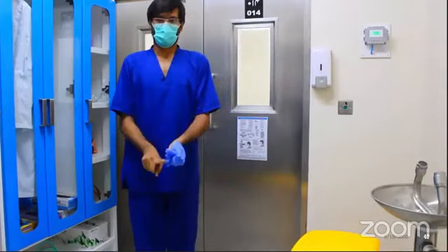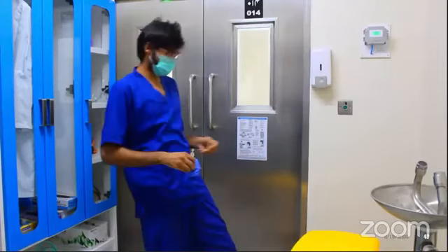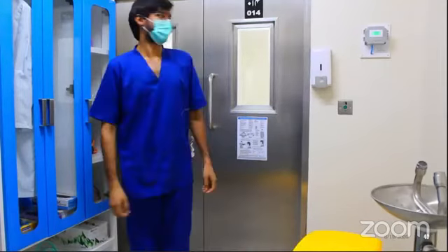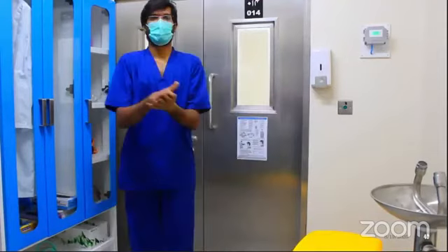Now remove and discard the gloves. Take care not to contaminate the bare hands. Sanitize hands properly after the removal of PPE.